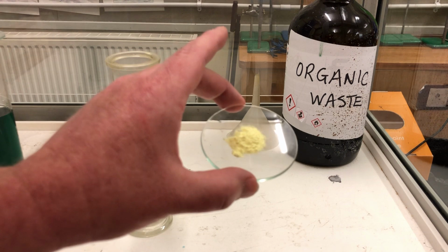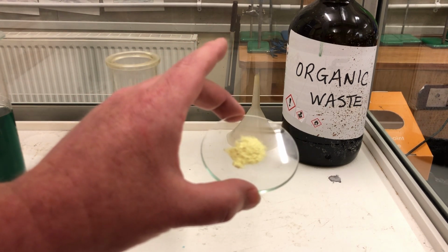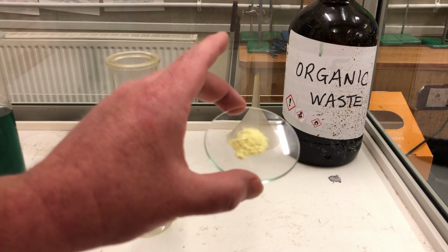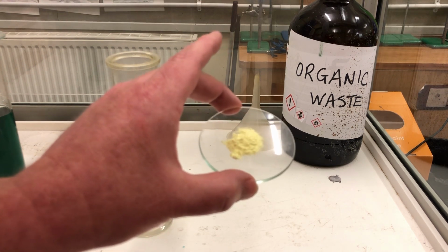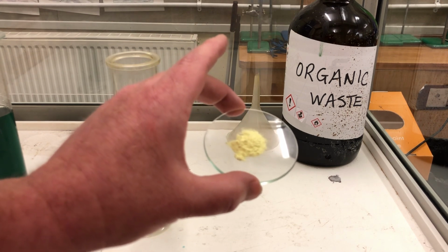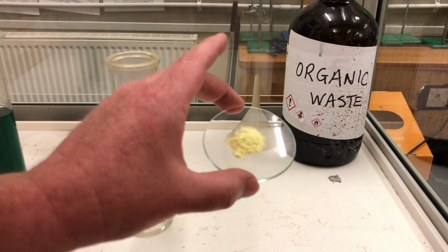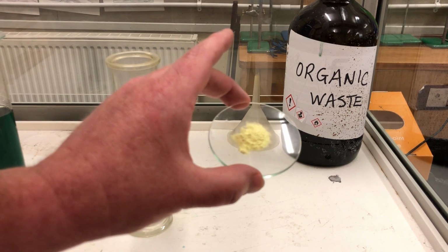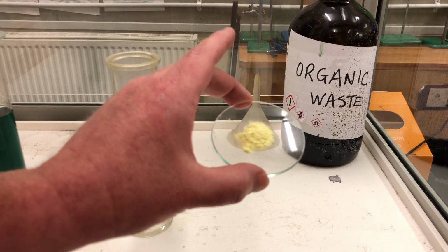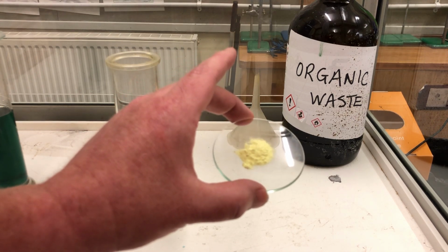So all fossil fuels contain sulfur. We've seen already how the carbon in fossil fuels becomes carbon dioxide, and the hydrogen in fossil fuels becomes water. This reaction you'll see today shows what happens to sulfur when it burns, as the impurity in the fossil fuels. But today we will burn pure sulfur.